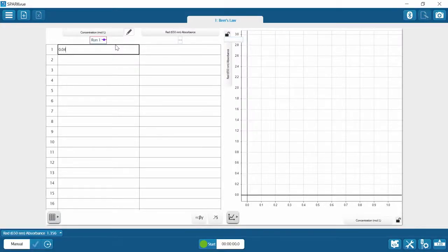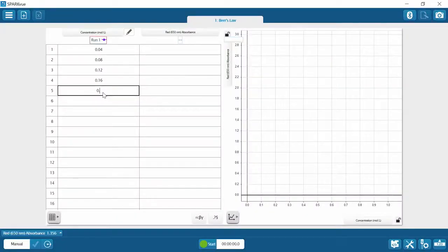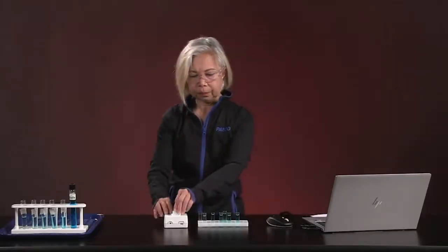0.04, 0.08, 0.12, 0.16, and finally 0.2. I think we're set. Let's start with our first sample.